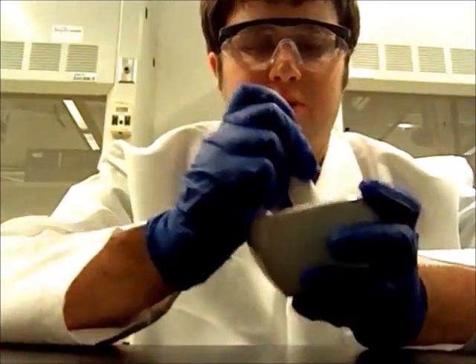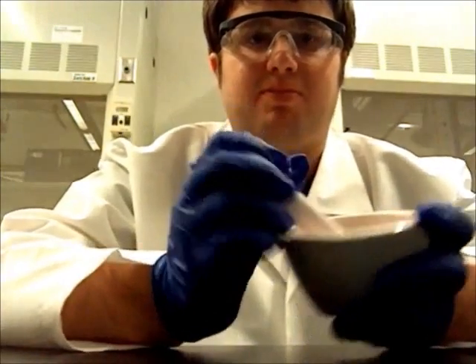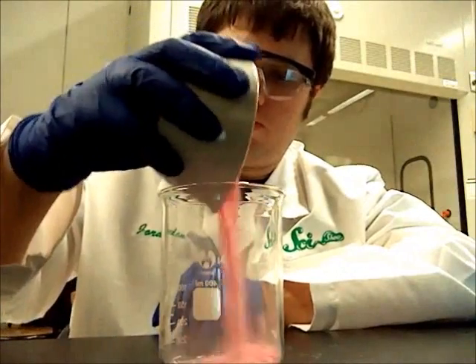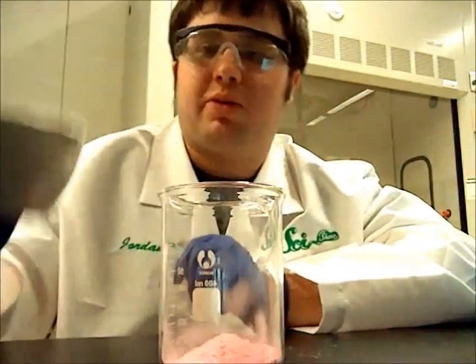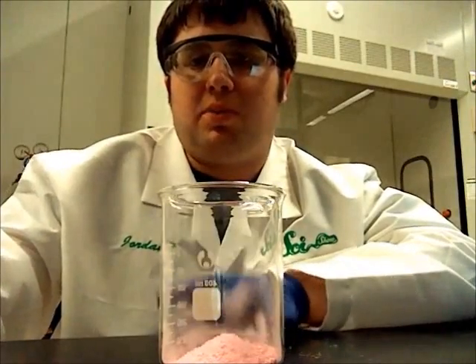To maximize yield, I'm using 30 tablets. You then transfer all the Pepto-Bismol to a beaker. I'm using a large beaker because when it reacts later, it will bubble quite a bit.